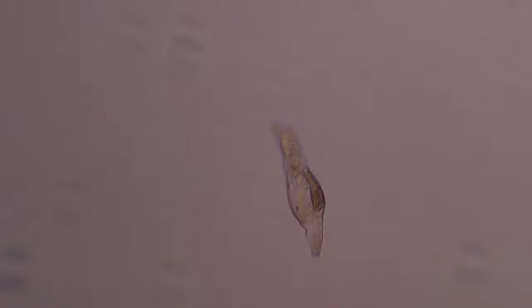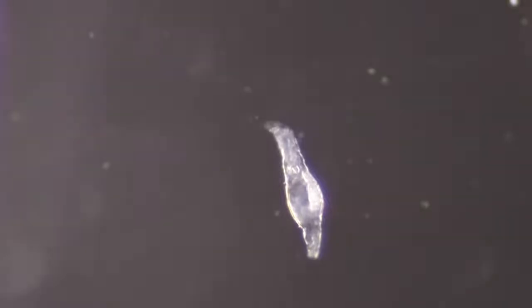Let me see if I can switch to dark field again so you can see the debris coming out of the bottom. You see it's very fuzzy at the bottom. Or in this case, the image is inverted, so it's the top. Very fuzzy. And you see little particles moving around down there, little bacteria and stuff. Just barely see it at this magnification.